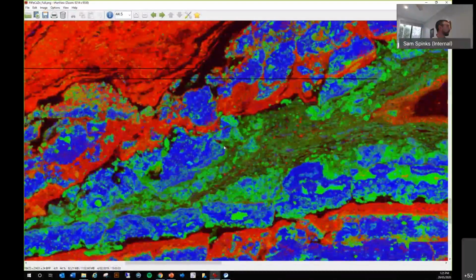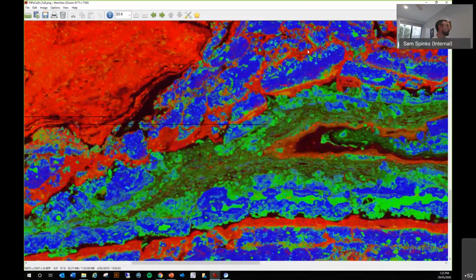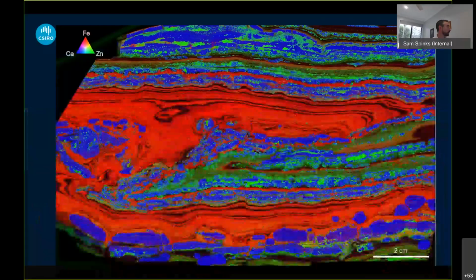Now, in this sample, what I want you to draw your attention to is this red zone, which occurs in between the sphaleritic carbonate nodules that have all been a bit brecciated in this folded zone. Everything's kind of broken up, and this is all laminated carbonaceous silt, which is a little bit lower grade. So it's in this area through here that I want to draw your attention to. Jump back into PowerPoint.